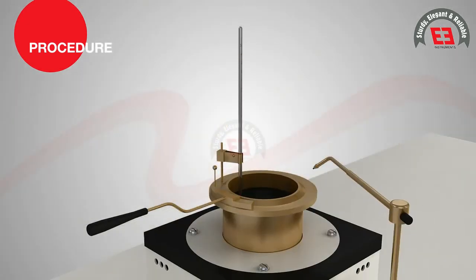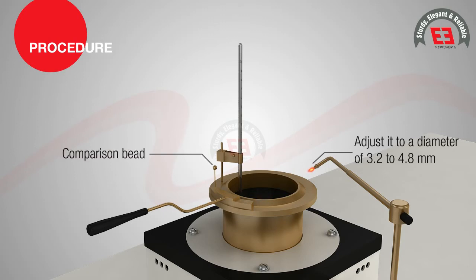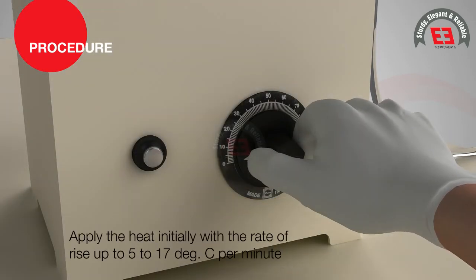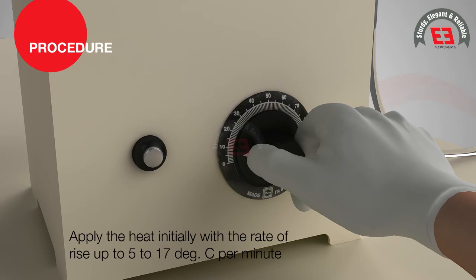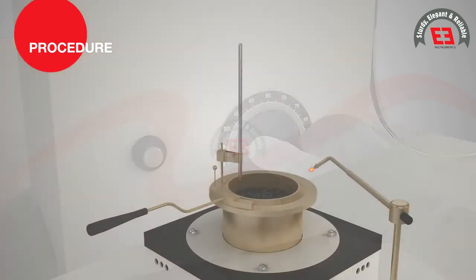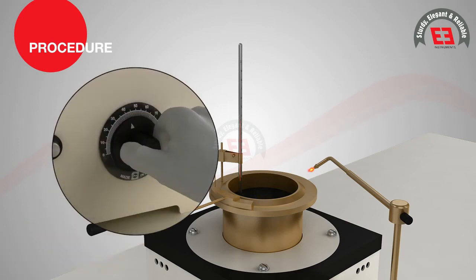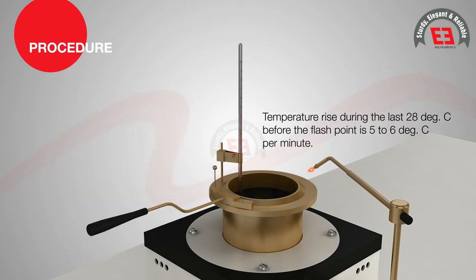Suspend the thermometer in a vertical position in the thermometer clip. Light the test flame and adjust it to a diameter of 3.2 to 4.8 mm to match the size of the comparison bead. On the regulator, apply heat initially with a rate of rise of 5 to 17 degrees Celsius per minute. When the test temperature is approximately 56 degrees Celsius below the expected flash point, decrease the heat so that the rate of rise of temperature during the last 28 degrees Celsius before the flash point is 5 to 6 degrees Celsius per minute.